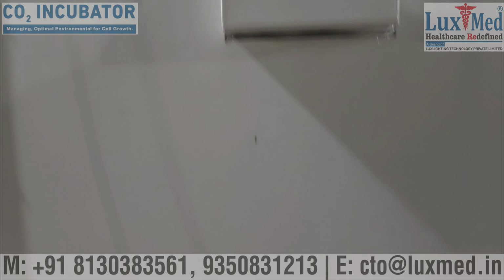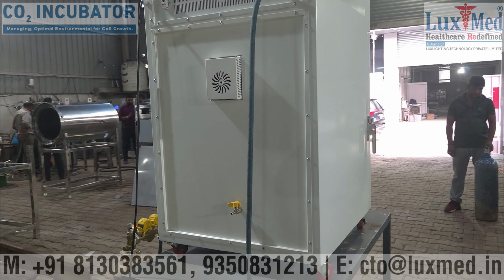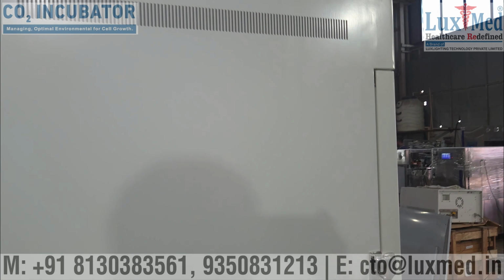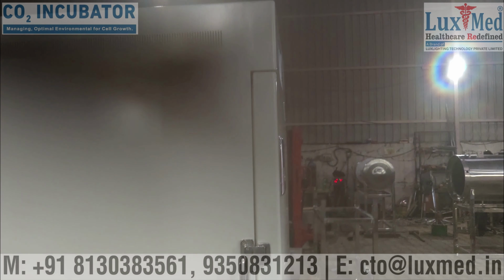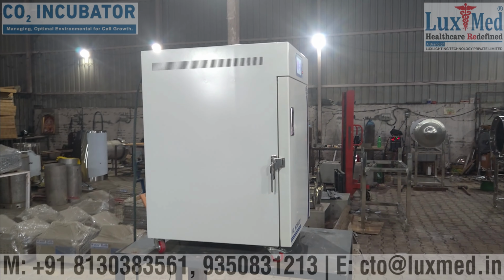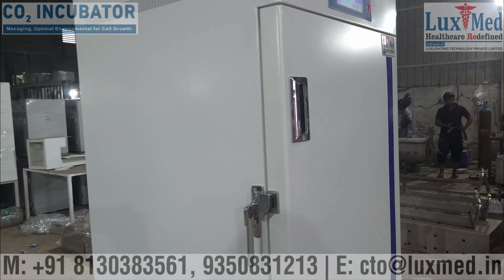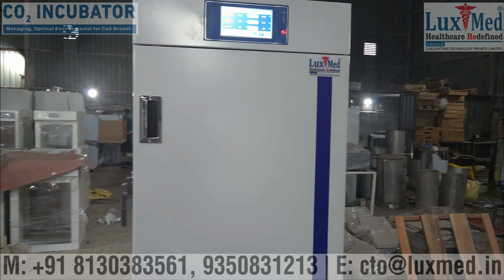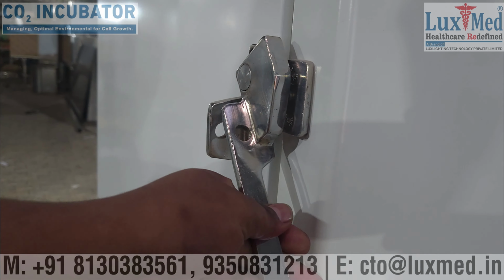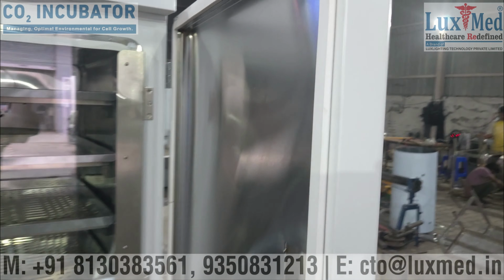Drug discovery and development. CO2 incubators are used in drug testing and the development of new medications, as they allow for controlled cell culture conditions for drug screening. Tissue engineering. They are utilized in the development of tissue-engineered products, such as 3D cell structures for grafting or tissue repair. Research and development. CO2 incubators are widely used in various research fields, including immunology, oncology, and cell dynamics.